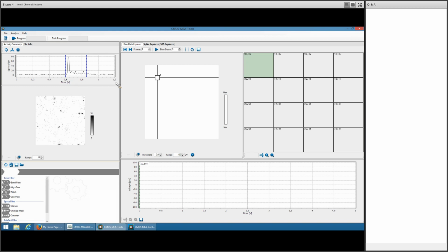This was just a 1.2 second file, and it's still several hundreds of megabytes large. I've chosen that small file to be sure that it can be loaded. But if you do extended recordings, or even only a few minutes, you run into several gigabytes easily. So within that file of only 1.2 seconds, I have the possibility to choose an area within that file to be loaded into the RAM of the computer and have a closer look at that.